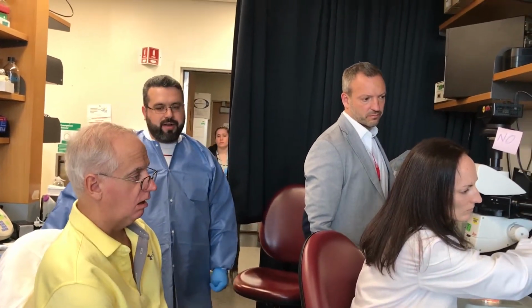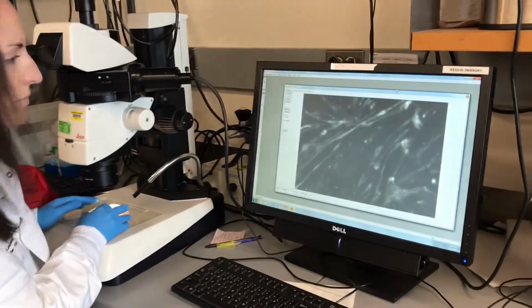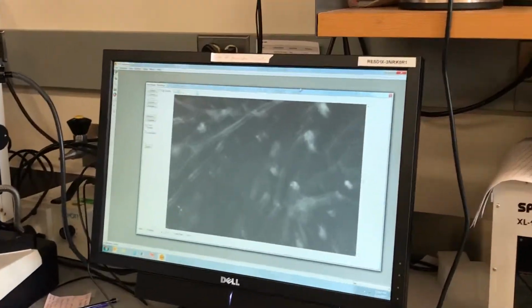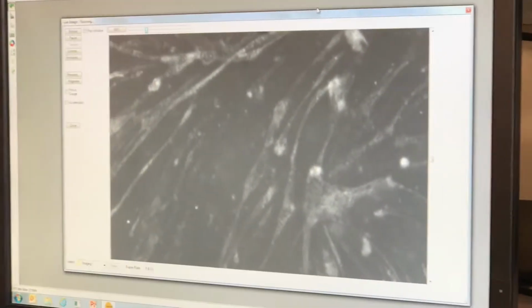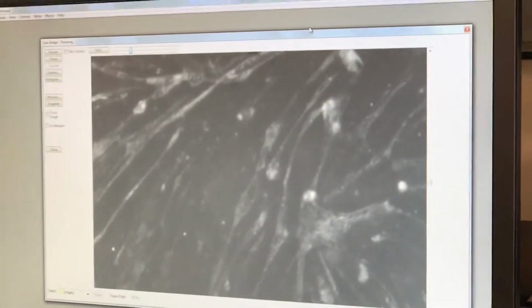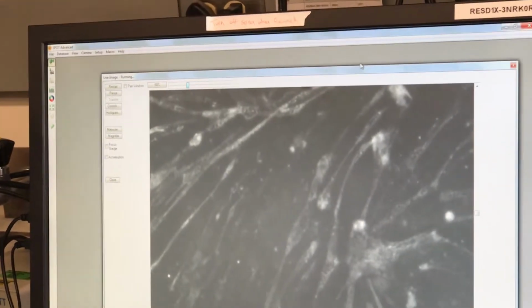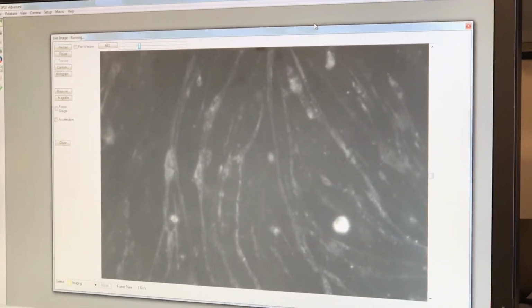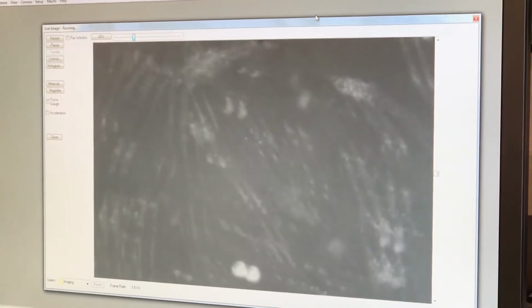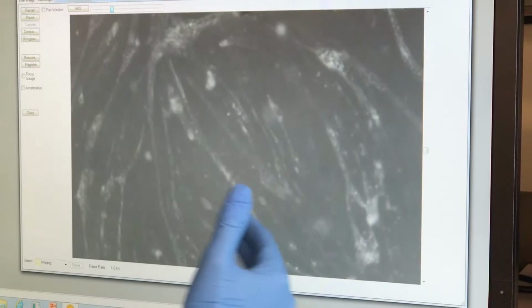With other microRNAs. Oh, now these are living. Yeah, essentially live. What I've done here is, you're seeing what I can see through the microscope. So we've just changed it. This knob here takes the view and the light path from the eyepiece, so what I can see, to the camera. So this is essentially a bright field image. The camera is a little slower than what you're doing, but these are the tubes forming.